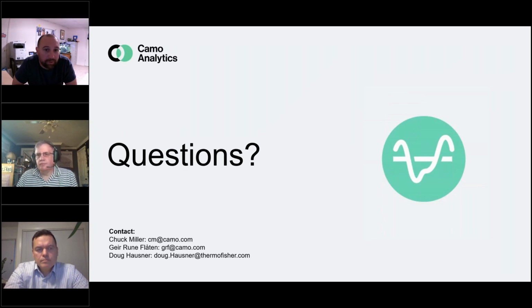Like I said earlier, you may not have the time to average a large number of scans like you might from a traditional bench, and so you need to understand that when you're developing things early on, to minimize the amount of rework as you get closer to really utilizing these for the purpose you set out for in the first place, right? You're looking to use these in your manufacturing environment to get efficiencies and to control things from a quality standpoint. And so thinking about it early on is a big part of being able to get that efficiency.